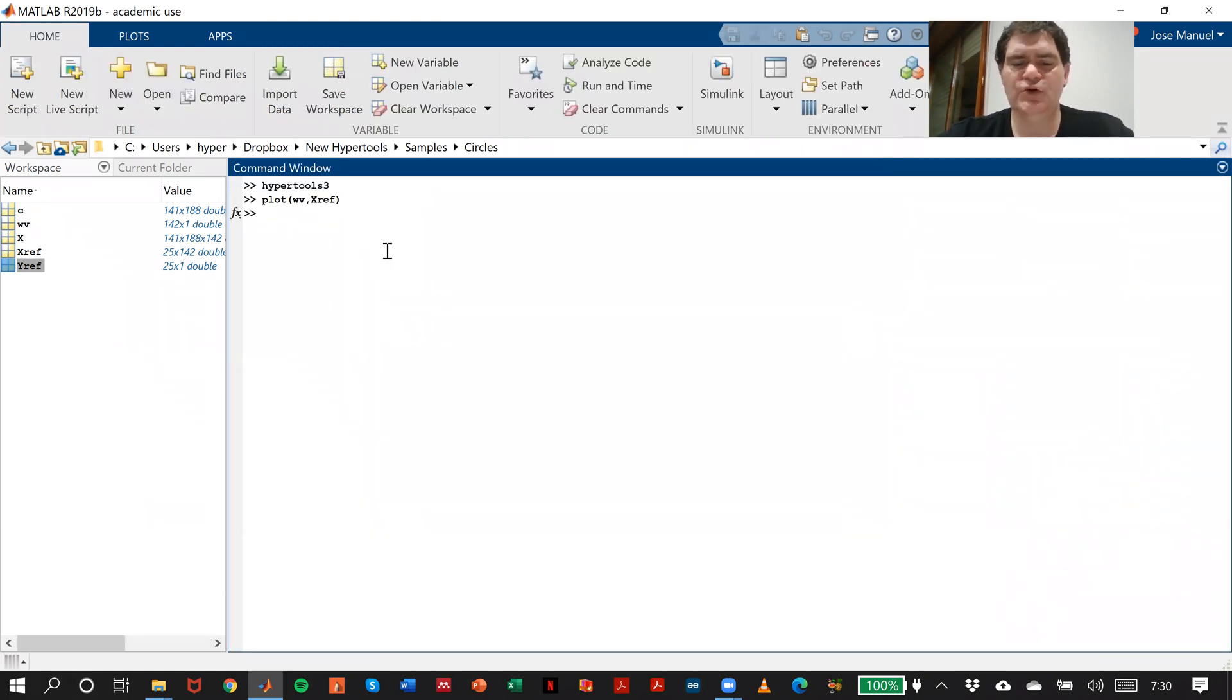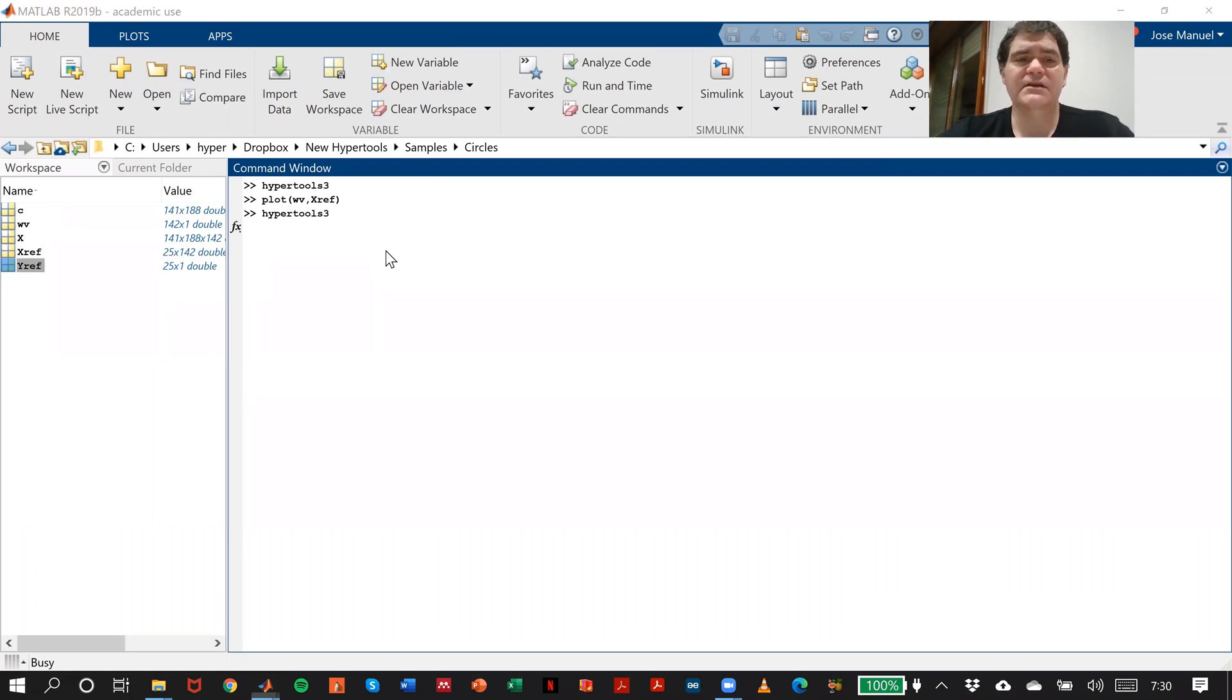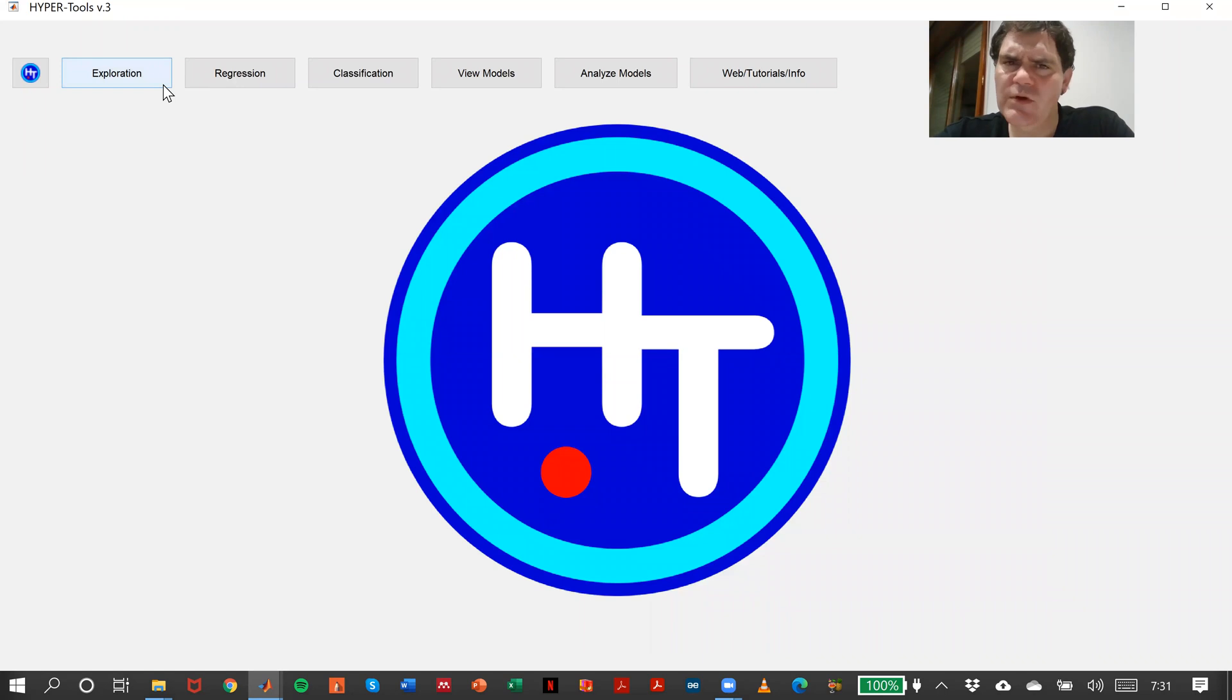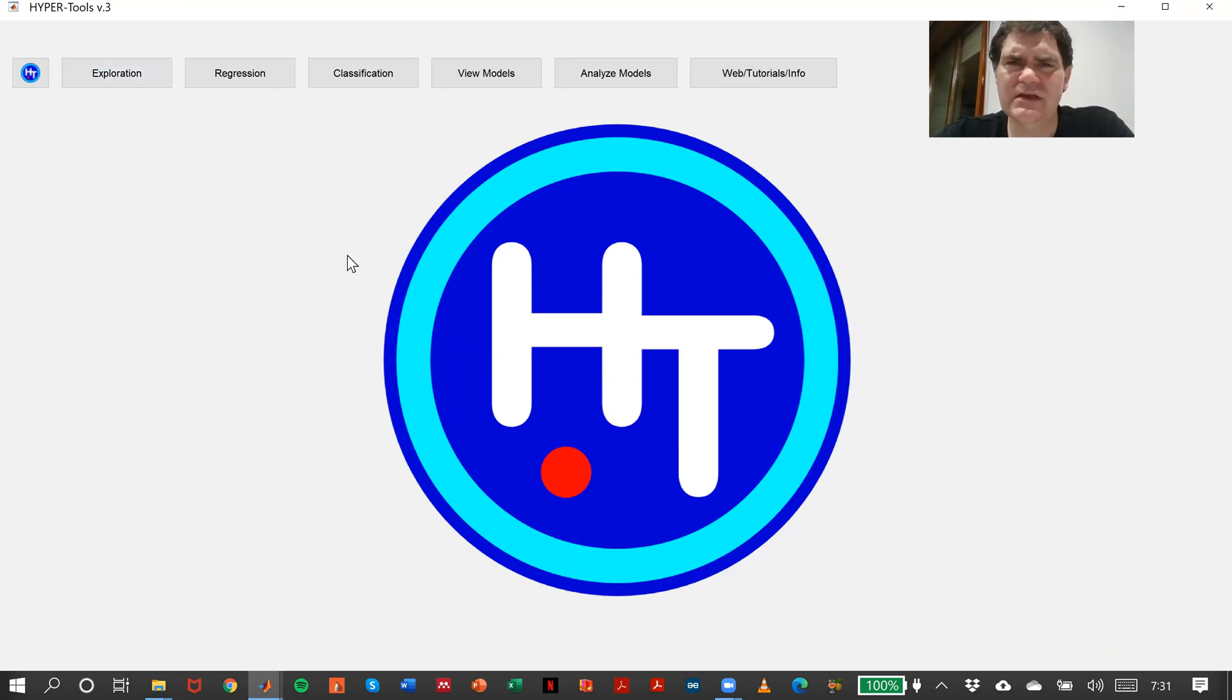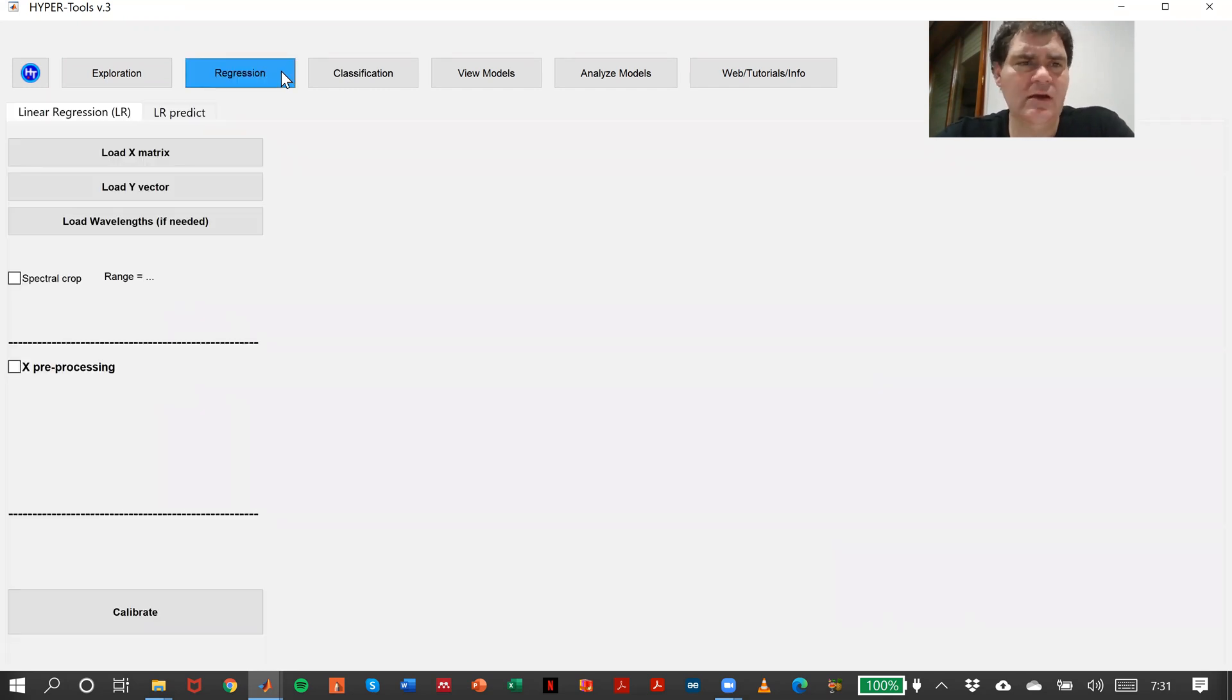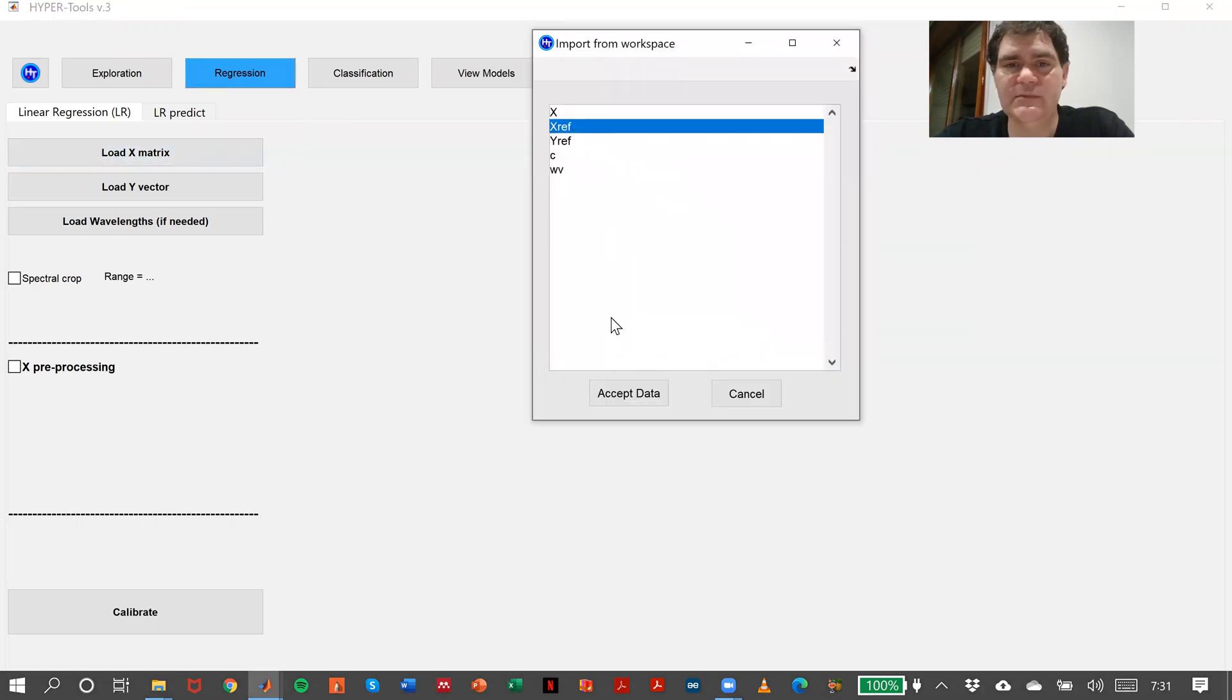The first thing I have to do is open hyper tools. I can check in exploration which preprocessing is going to be better for my image. Assuming we know it, load X matrix, and it's my reference matrix.